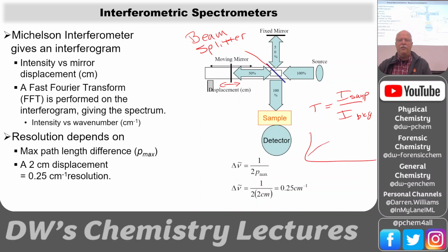And so you might have this infrared spectrum, look, our background here, and then the sample spectrum comes along and it's got a missing amount of light there. And so that's where we get a drop in transmittance. So we take that ratio, and this is what our spectrum looks like.